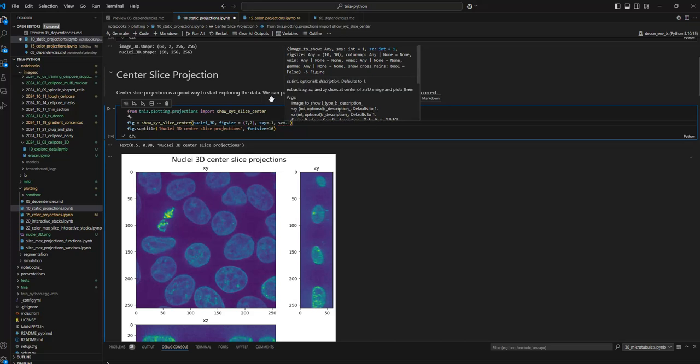For this image, I don't know exactly what they are, but in microscopy a decent first guess is 0.1 microns in XY and maybe 0.3 in Z. Of course, for a real project you really want to know what they actually are, but just for this little tutorial, I'm going to estimate 0.1 microns and 0.3.